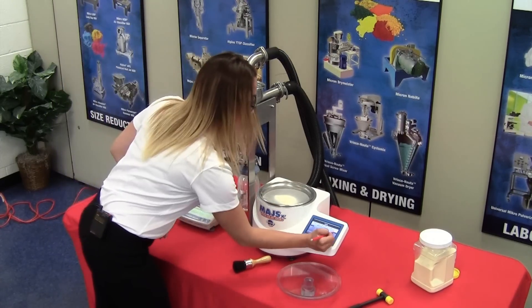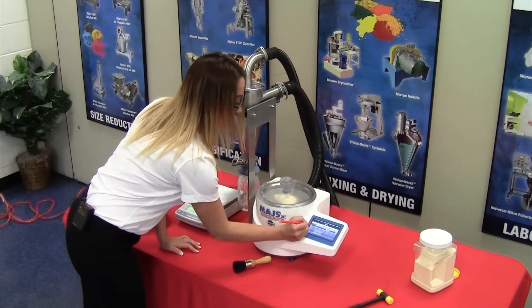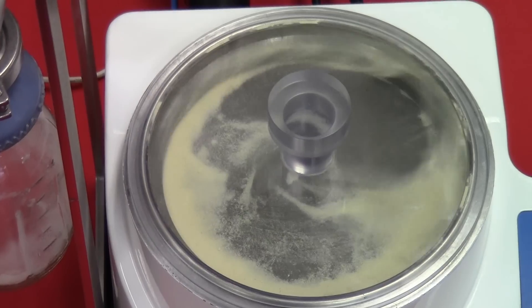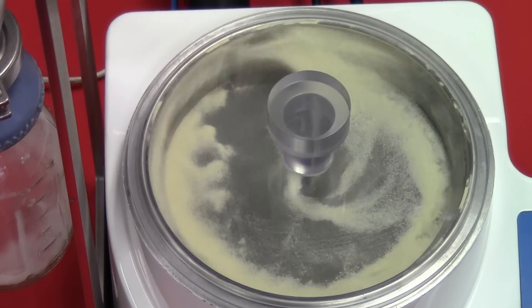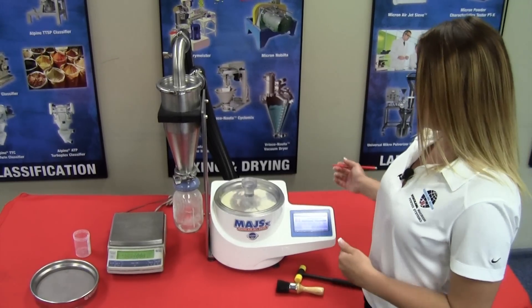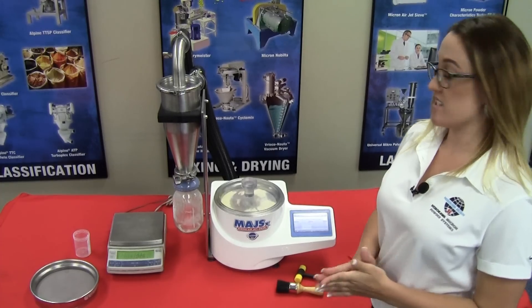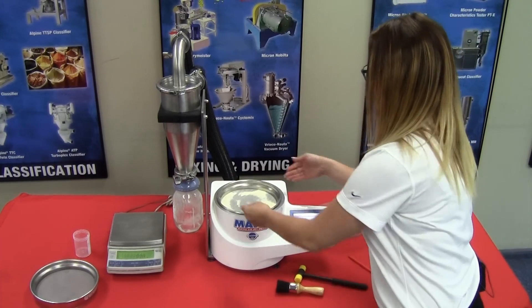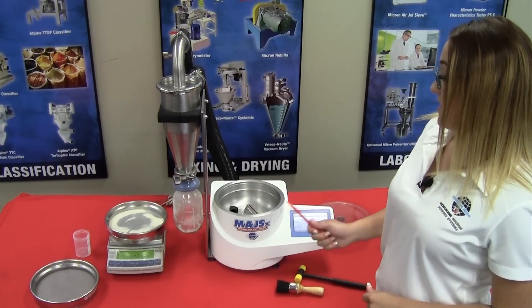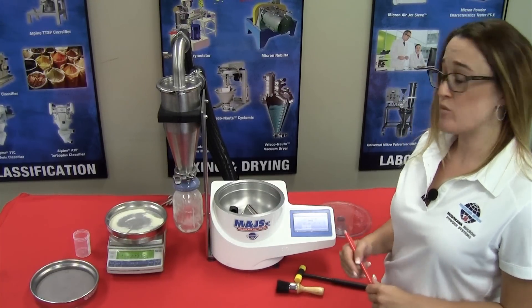Press Next, then place the lid back on the Airjet Sieve and press Start. Once the sieve is completed, press Next, then Next again. The software then indicates: place the 53 micron screen with the sample on the scale. Once the scale communicates with the Airjet Sieve, press Next. Testing is then completed and we move to the report page.